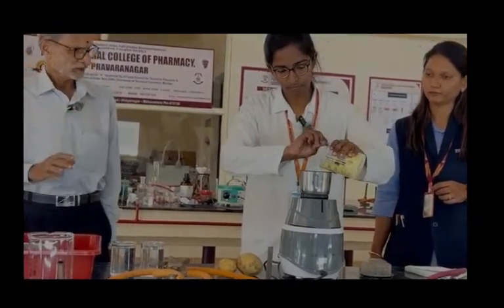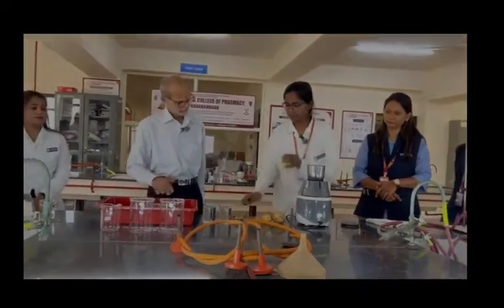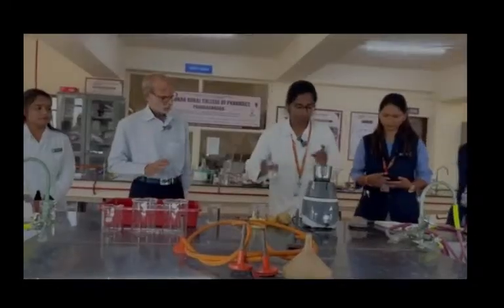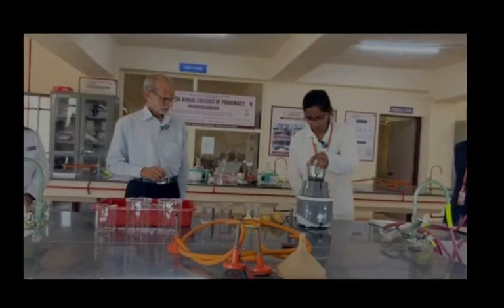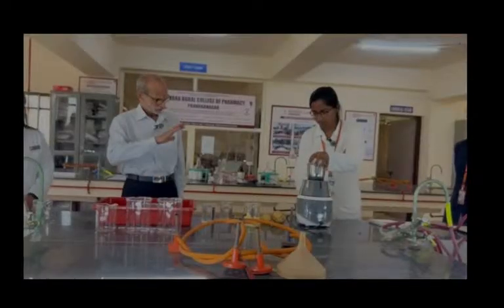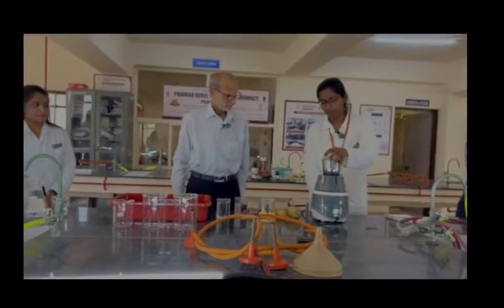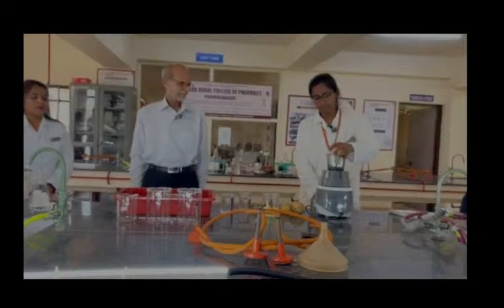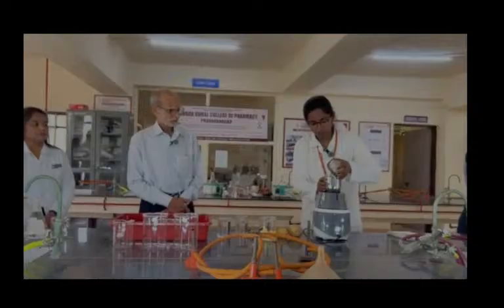Okay, so now we are going to make a pulp out of it and pass it through the mesh.